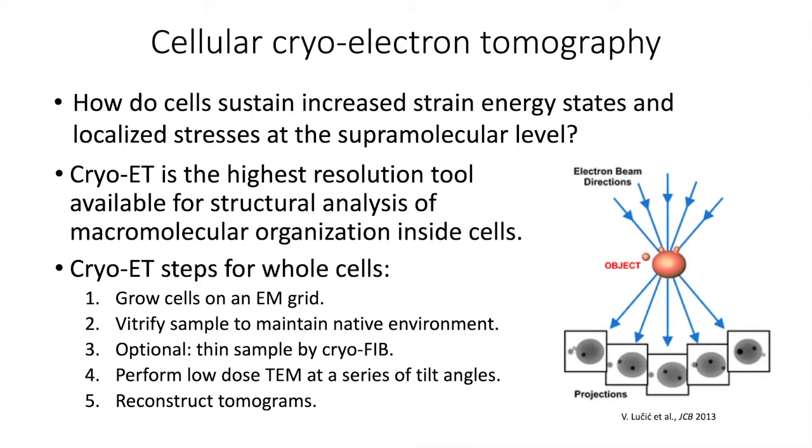Micropatterning on EM grids can be an enabling technology for super-resolution mechanobiology studies, as cryo-ET is the highest resolution tool available to us today for structural analysis of macromolecular organization inside cells. By micropatterning EM grids, we reasoned that we could enable direct observation of mesoscale organization in cells under morphological modulation, and that's what provided the motivation for this work.